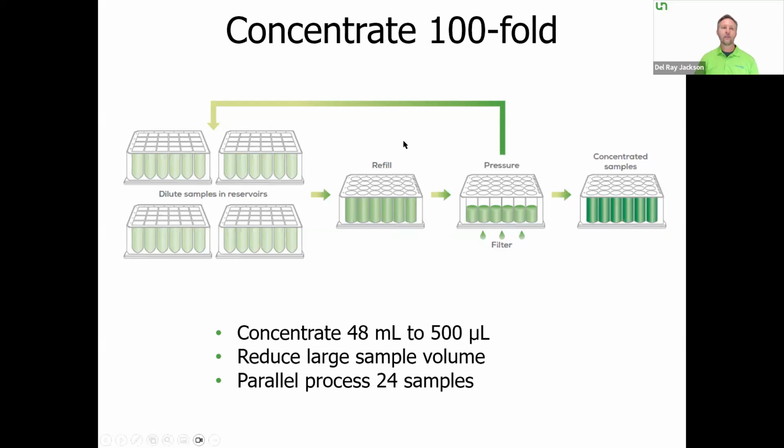The way that this is accomplished, as you can see from the nice cartoon on the screen, is that we keep some of your samples on the deck outside of the Unfilters. If it's a little bit confusing right now, understand we haven't seen a close-up of Big Tuna yet, but it will make sense in a few slides.